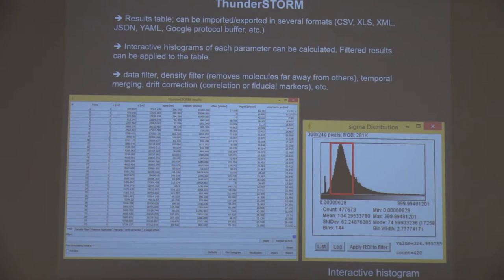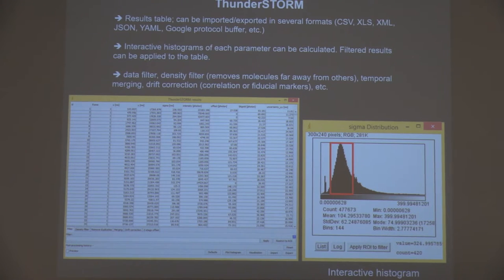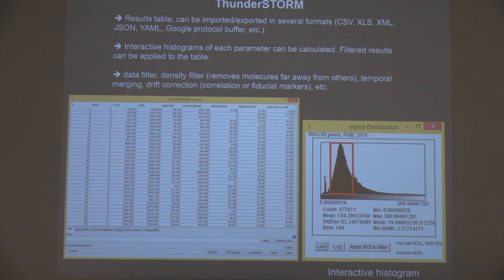This is the results table. The data can be imported or exported in many different formats. We have interactive histograms of each parameter — the number of molecules, which frame they were in, the number of detected photons, and so on. You can plot a histogram of that, draw a box, and click to apply a region of interest to filter. It automatically chooses that range of values and removes all molecules outside that range.